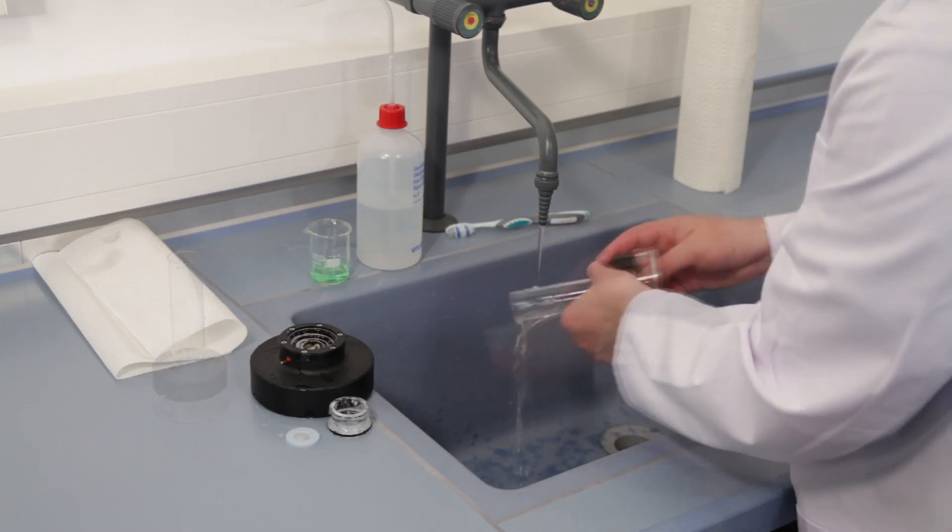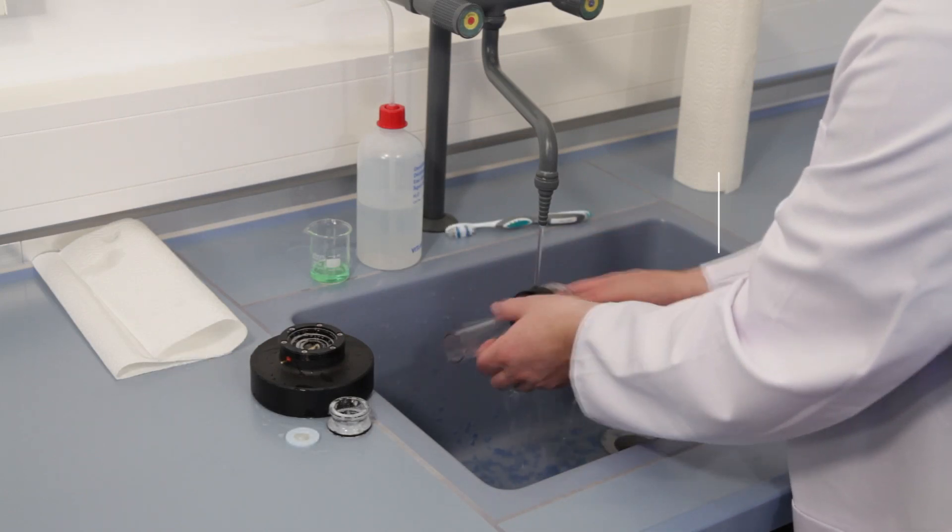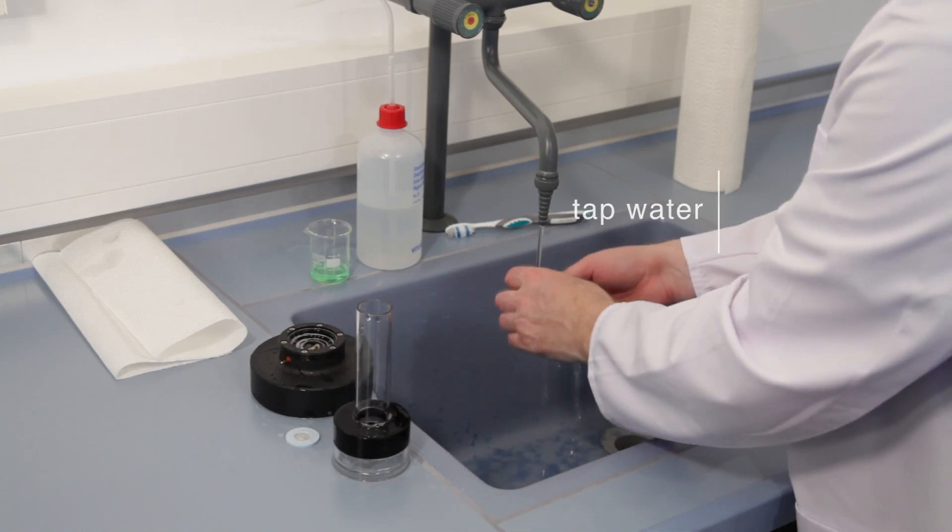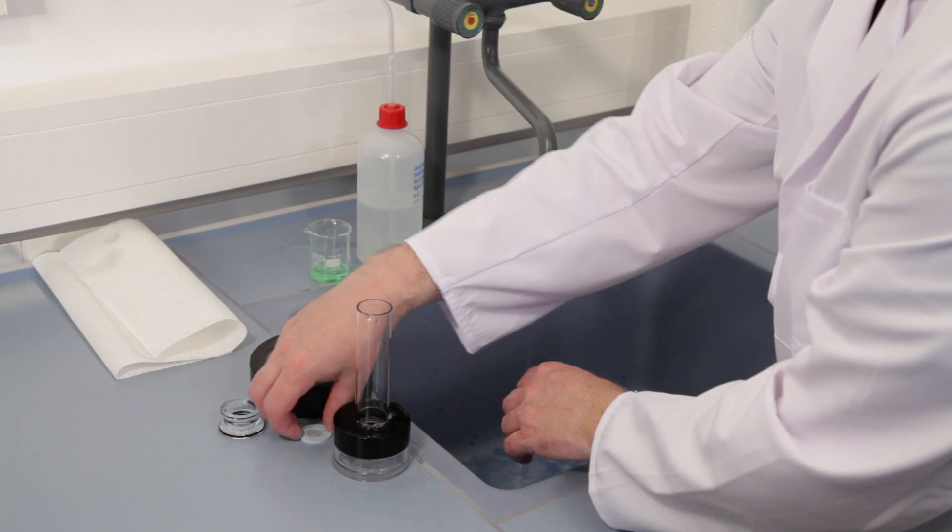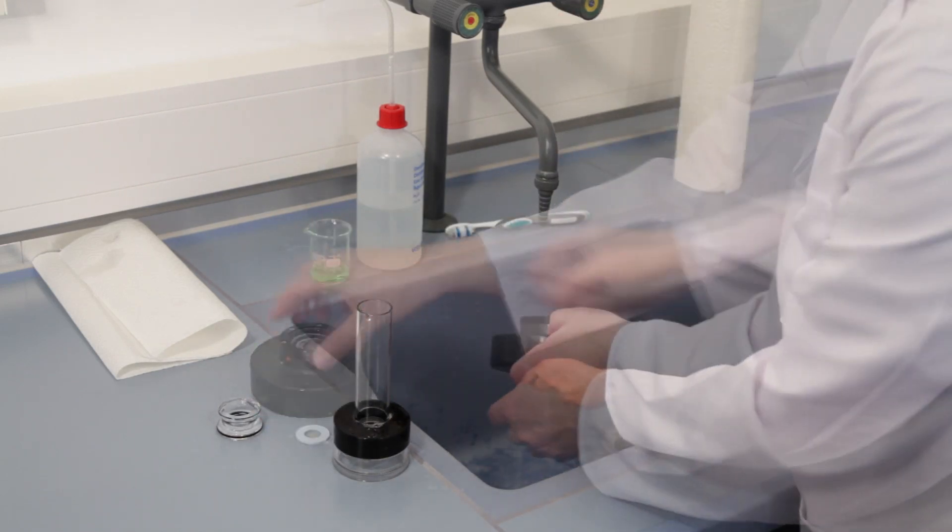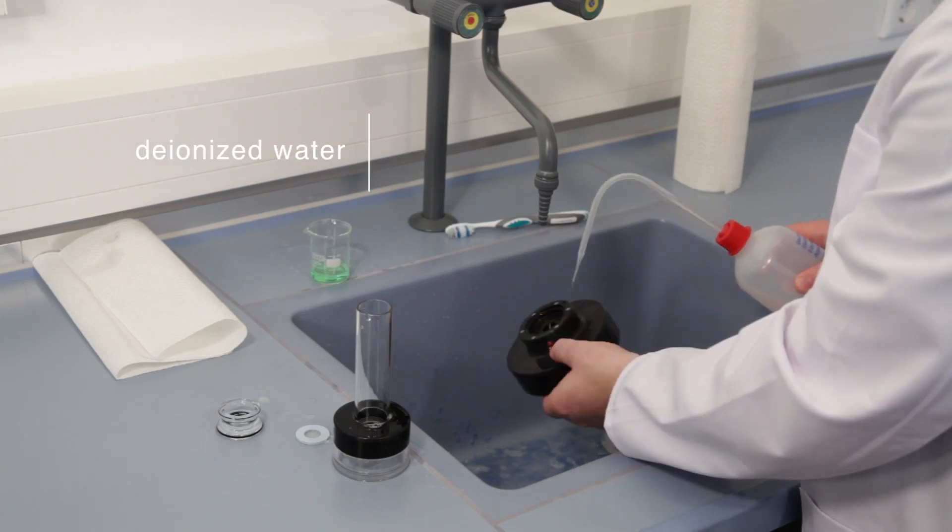Again, flush all parts under tap water thoroughly to remove residuals of the dishwashing detergent. Flush all parts with deionized water.